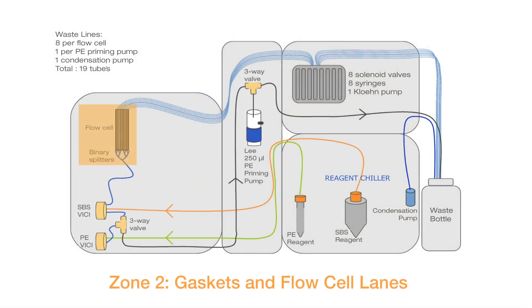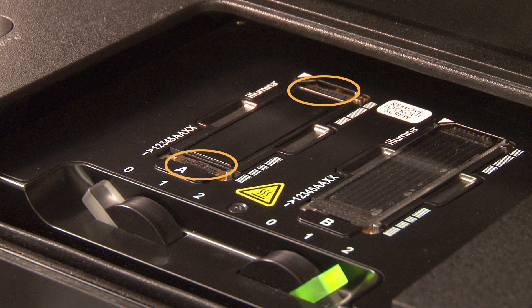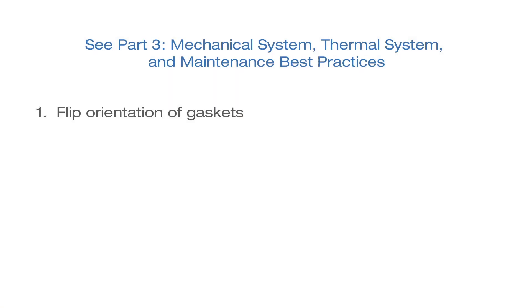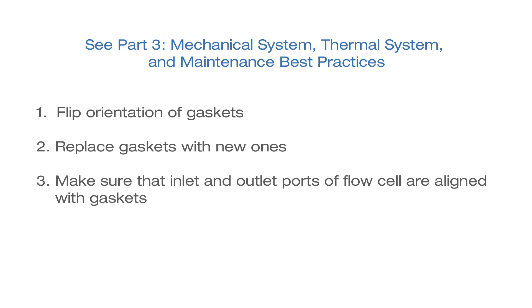If a single lane is blocked or there is slow flow, then the issue may be with the gaskets. As demonstrated in Part 3 of this video series, flipping the orientation of the gasket in the front or back of the flow cell can help determine if the blockage is related to the gasket. If the blockage follows a particular inlet or outlet on the gasket, replace gaskets with new ones. If the blockage remains with the original lane or lanes, then the gaskets are not the source of poor flow. The inlet and outlet ports of the flow cell may not be aligned with the gaskets — visually inspect the alignment and position the flow cells to ensure proper flow.